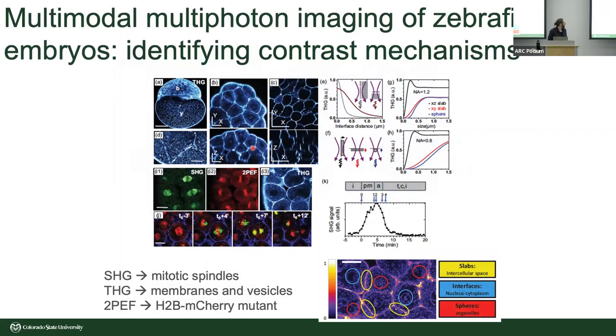Okay, so that kind of sums up laser scanning multiphoton microscopy. And I know we're very close to time, but I wanted to spend just 2 quick minutes talking about another technique that we might be able to incorporate into the core facility. It's something that exists in the research lab and we've published on, and I would really love to find application spaces for us to start moving technology from the research lab to the core facility.